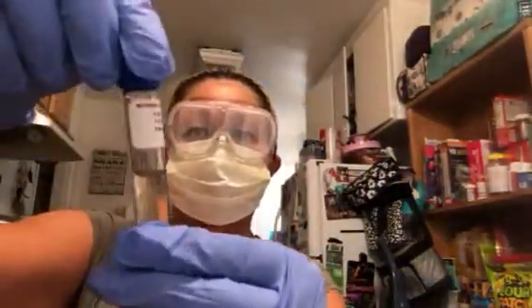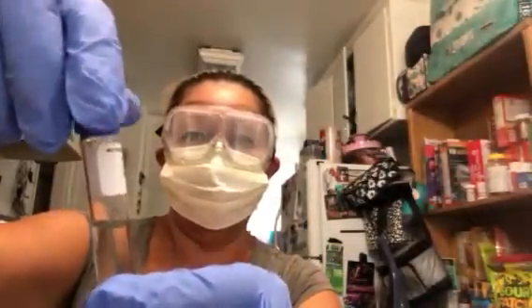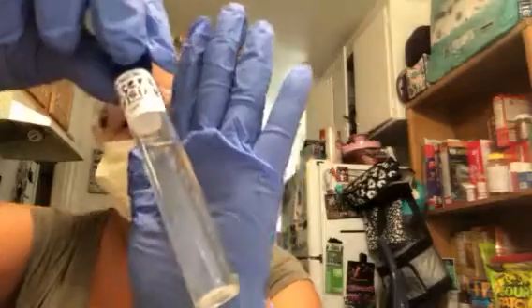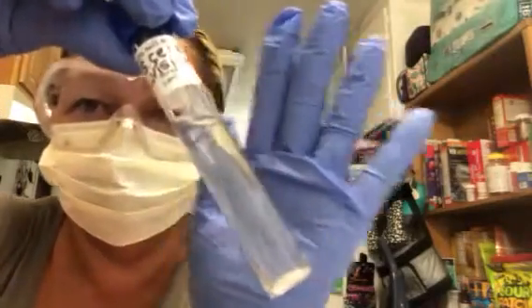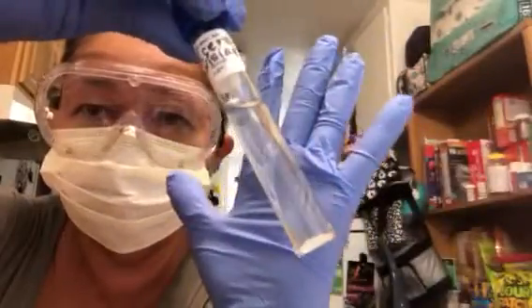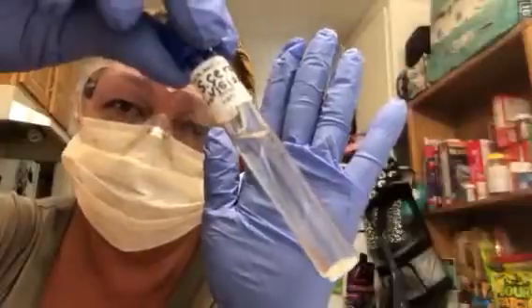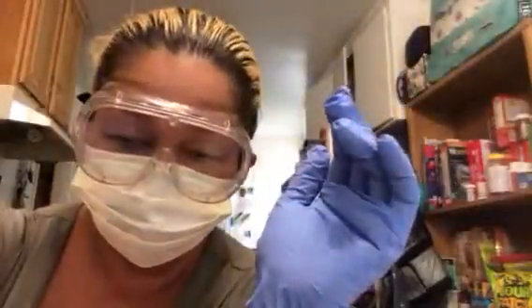Then I'm going to show you the S. cerevisiae, nutrient broth at 7%, which is right here. Still rather clear, but maybe just slightly turbid, actually. Trying to get a good background so you can get a good sense of that.